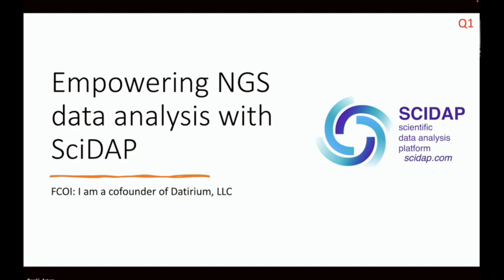So today I will be talking about our data analysis platform and how it can help you analyze your various NGS-based data.